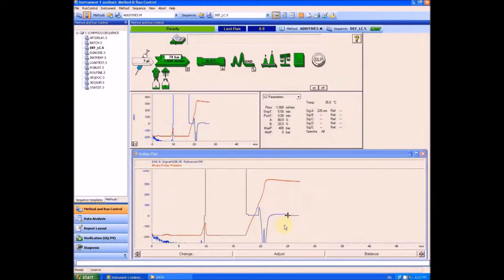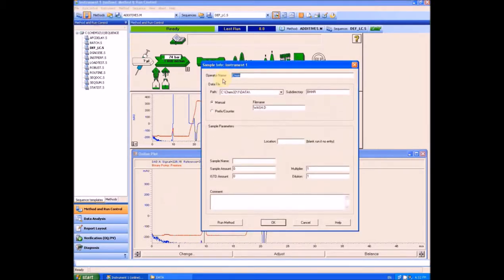Now that the system is stabilized, we can enter the sample information with the operator name, the directory to put our data files into, and a file name.